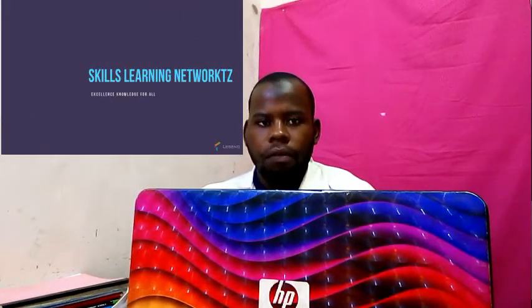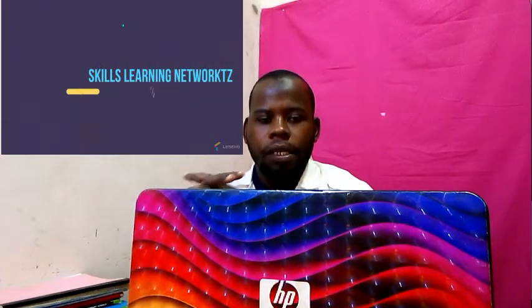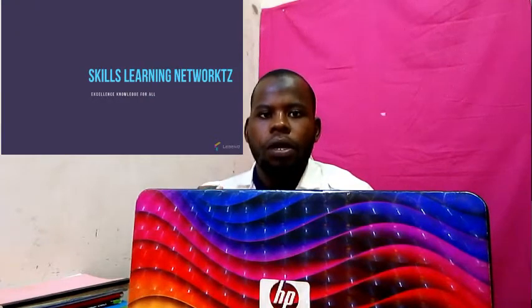This is a new lesson, Chemistry Practicals, advanced level. Our topic is how to perform experiments which involve partition, the distribution law, and the partition coefficient or distribution coefficient, KD.